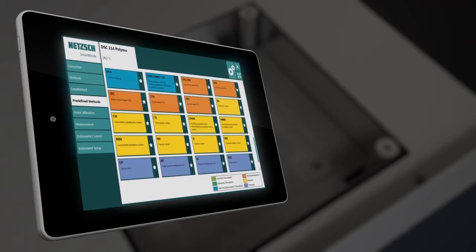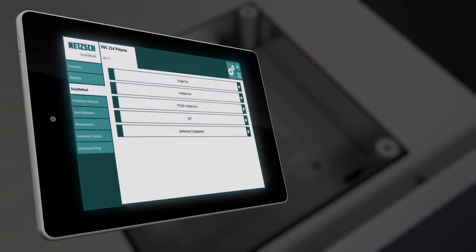Imagine a software that gives you access to the experience and knowledge of the NETZSCH Polymer team and accompanies you during the measurement. A software that is perfectly adapted to your needs, whether you are a beginner or an expert.